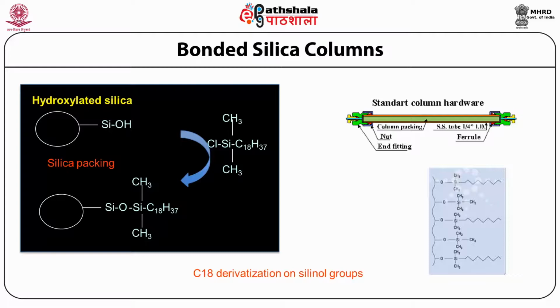That is a normal phase which has a silanol group, a hydrophilic silanol group, getting converted into a hydrophobic C18 chain, which is highly hydrophobic. Now, when you are passing a hydrophobic solvent like acetonitrile or methanol through this, they try to adhere to the C18, and thereby you create a sort of partition between two liquids.